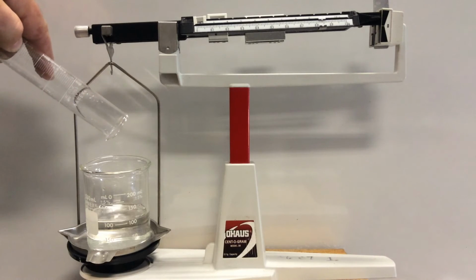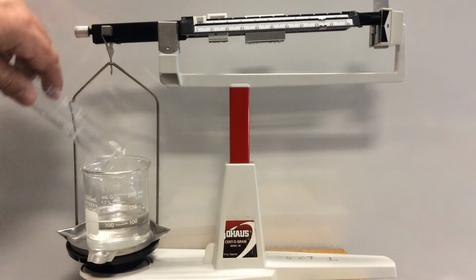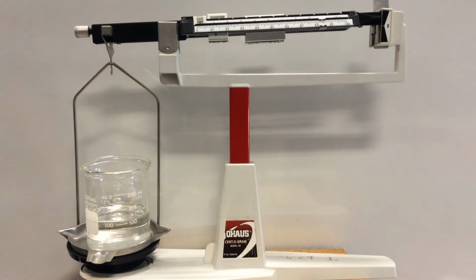Think about some forms of error that could occur in this lab. Okay, obviously you can see the riders are now unbalanced. Now I have to move the riders from the position I have, and from that position we can figure out the mass of the water. So we have the mass of the container, and now we're going to have the mass of the container plus water. You probably can figure out how easy it is to get the mass of now the liquid.